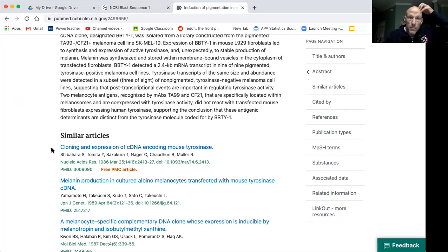All right. You know, we're not going to become experts on this. I just want you to take one sequence, try to research it, come up with some stuff, look at a cladogram, see if there's any latest research on that, and all by the power of the internet, right? You've got that right in front of you, which is kind of cool.